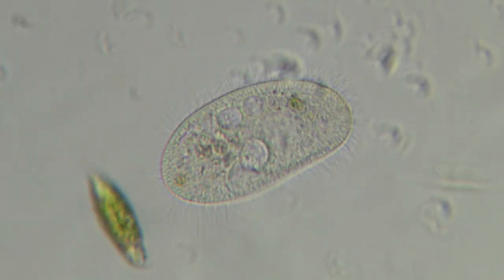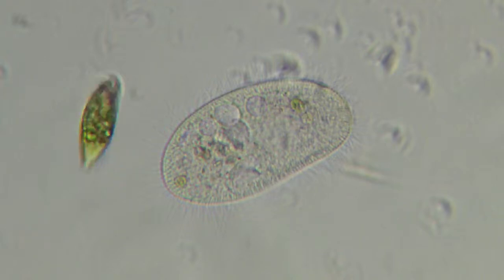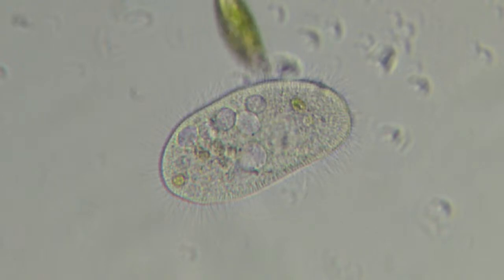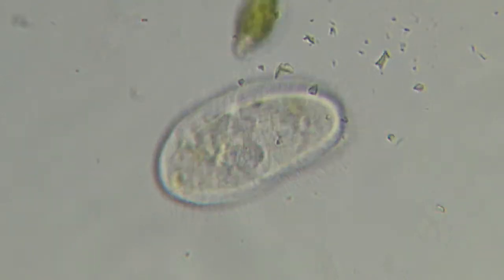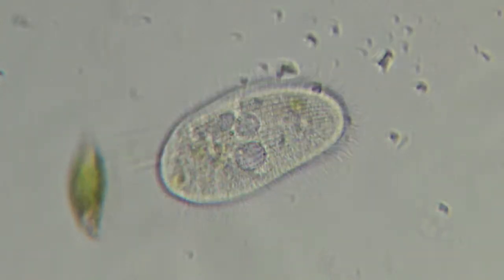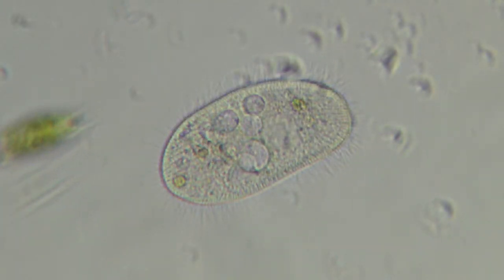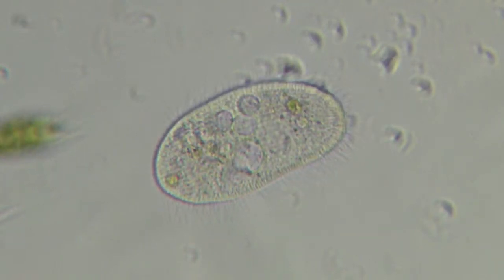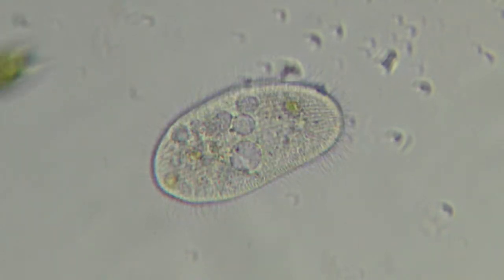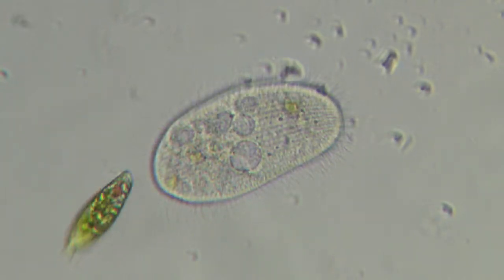Real obvious in the paramecium and stuff. I have a video of that. You can see the contractile vacuoles pumping. You can see the food vacuoles getting moved around the cell there. And you can see it's actually eaten a ciliated item that's inside the cell. See how I focus through the cell there? It captured a ciliated guy inside one of the food vacuoles there. See the flagella moving crazy inside that food vacuole. So it's going to get digested.